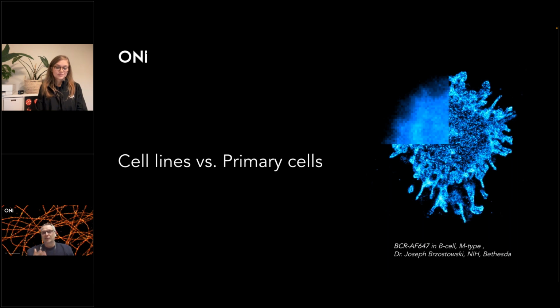An alternative method, as Laura was saying, is to use DNA-PAINT. In this case, your protein of interest is bound to one strand of DNA, and then you add a complementary strand which has a fluorophore. How this technology works in a nutshell is that you have one DNA binding to another one, the fluorophore is shining and you're detecting it, and then it's unbinding, and then you get another one coming in. Because all these fluorophore-labeled DNA strands are present in your sample, they just keep recycling. So you will be able to image for longer, and in this case, you will also resolve a quite high resolution image.